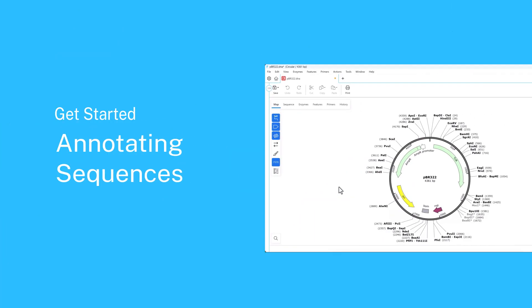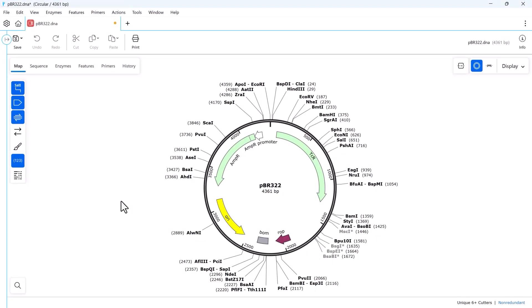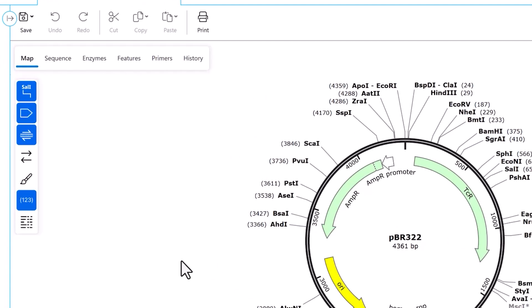Welcome to this video on annotating sequences in SnapGene. SnapGene offers three basic types of sequence annotation: enzymes, features, and primers.